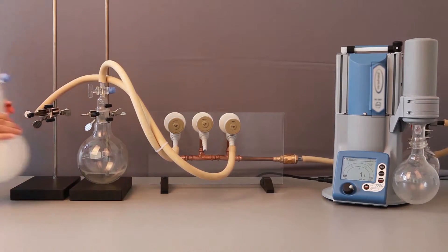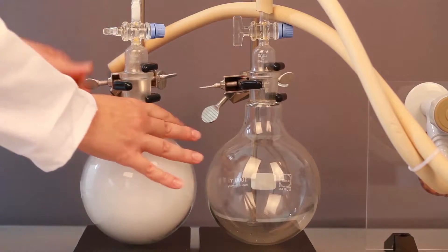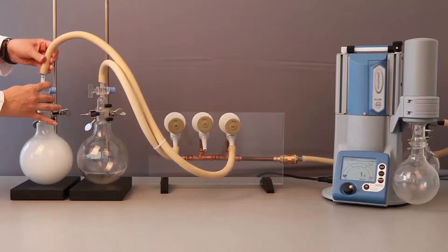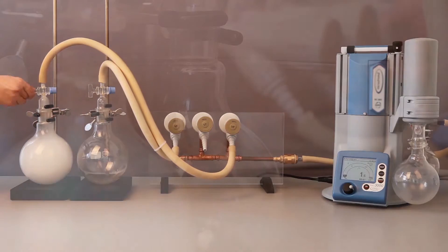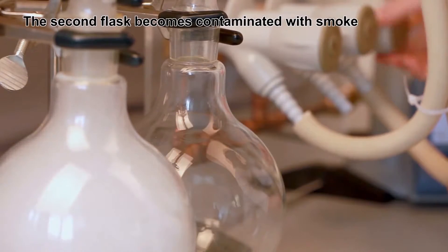We begin with a test setup using conventional bench vacuum valves and copper tubing. Pressure differences between workstations on central vacuum systems can cause vapors to move from one application to another. This can affect results and possibly contaminate samples.